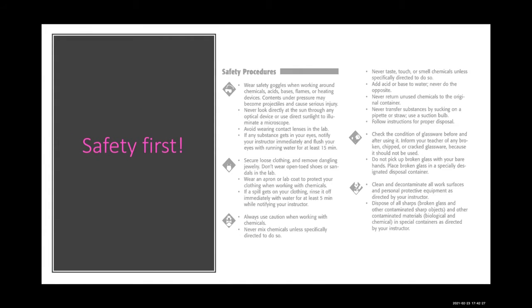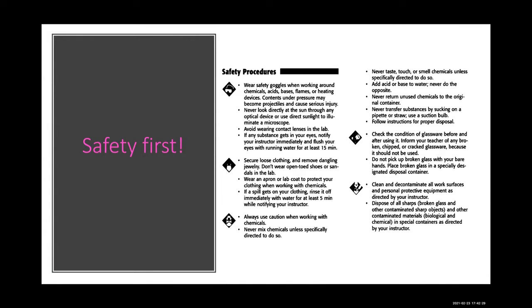So, safety first, we'll follow standard safety protocols for this lab, and we'll be extra sure to protect our skin and eyes when using strong acids and bases, even though they are diluted for our purposes in this lab.